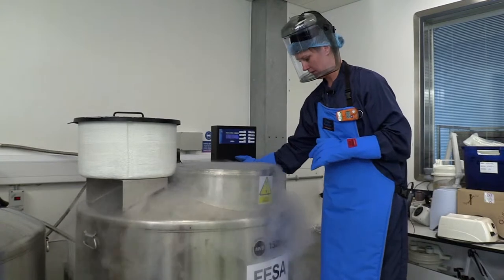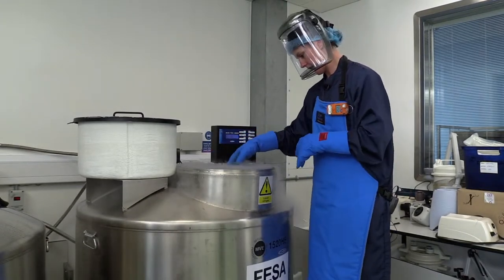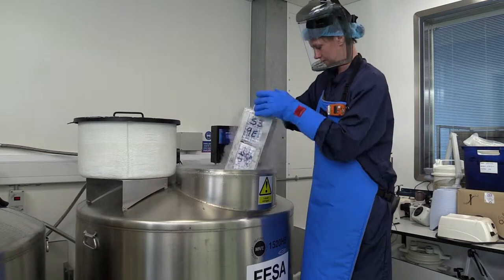So in here now, now that I've cleared the vapour that was on the top, I can see my samples. So now I can pull out these samples.